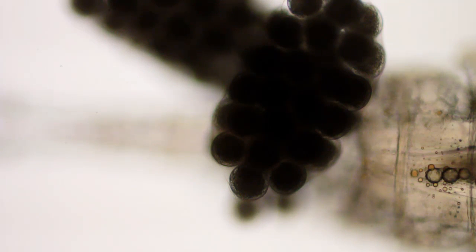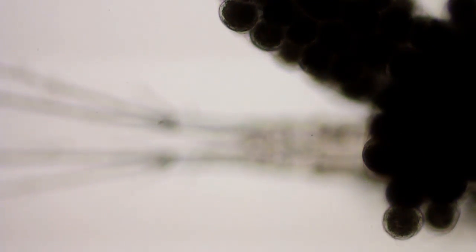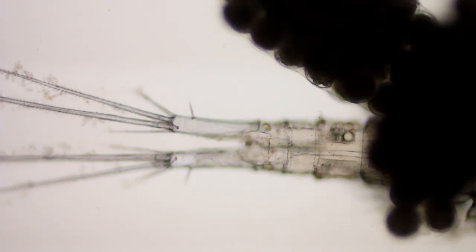It looks like the eggs are developing. And there's the tail — the two feet.